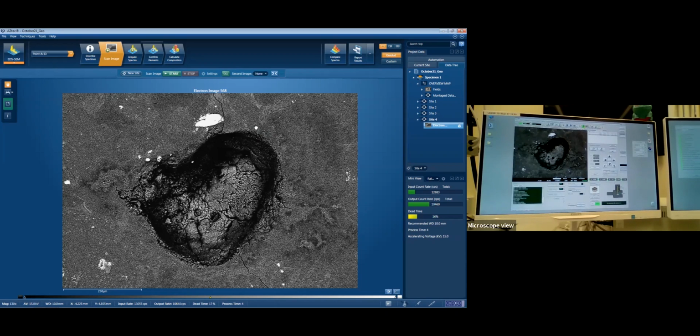Although BSE isn't as good as topography, you can still see a little bit of it in there. So kind of like this dark zone here, that's basically shadows from where, again, like Laura said, we've polished something and whatever grit mineral was in there has just plopped out during that process. Now there's just like a little hollow. But we still got these nice big chunky grey things. This texture in the background is a little bit weird. We can see there are some variations happening. There's a little bit of patches of darker grey.